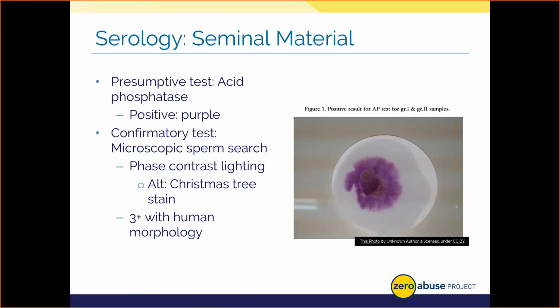Let's go ahead and cover the AP testing process, starting with the presumptive AP test. 1 to 2 drops of an alpha naphthol chemical solution are going to be added to a sample or a sample extract. We're going to wait around 1 minute and then add 1 to 2 drops of this fast blue or diazonium salt reagent. All this is carried out in a test tube typically, but I actually have seen and used in some of my classes AP-based wipes, if you will, that will run a sample. Once you run a sample across this surface, just by rubbing it onto that testing strip, it elicits a reaction. Let's talk about that reaction then. As you can see on your screen then, a positive result is a purple hue or coloration.